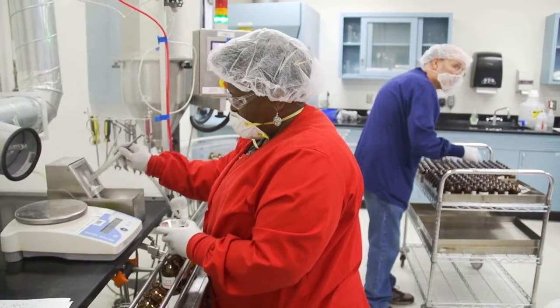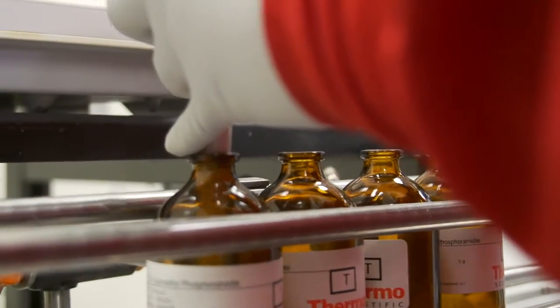Product finishing, where appropriate gowning and controls prevent cross-contamination.